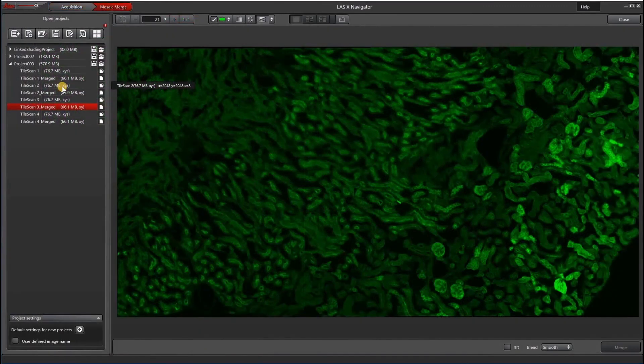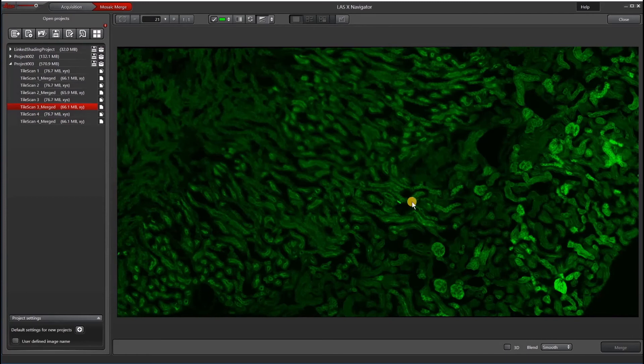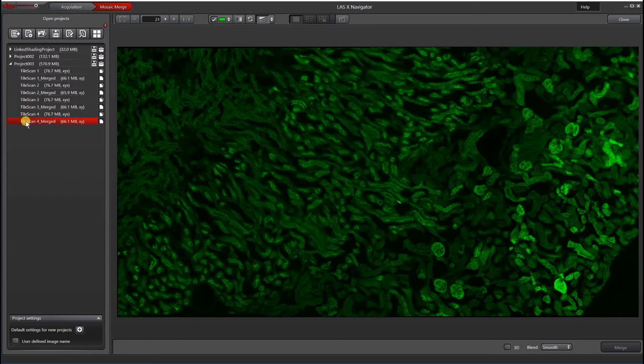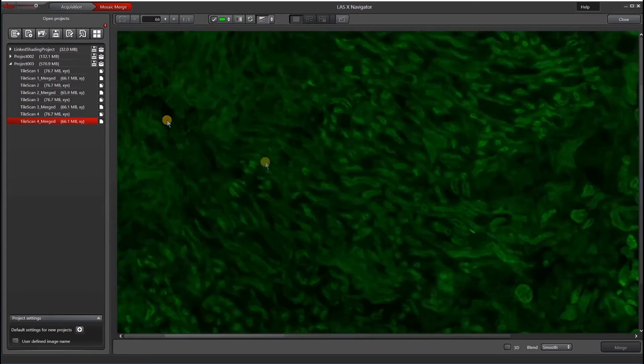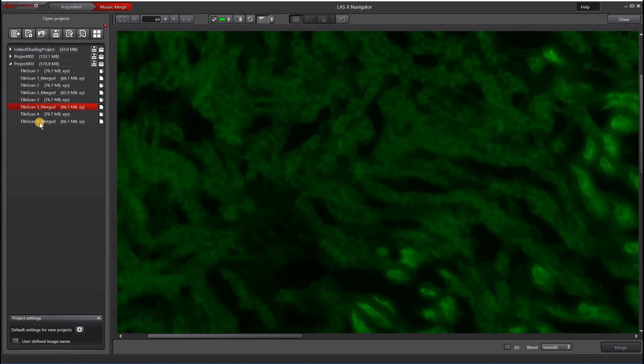Let's compare the image I just took with the AFC on to the one I took before without AFC. Again, this is the one that I took without AFC. You can see the out-of-focus areas. The one I took with AFC is much better. Let's focus on this region here. Out-of-focus, in-focus with AFC.